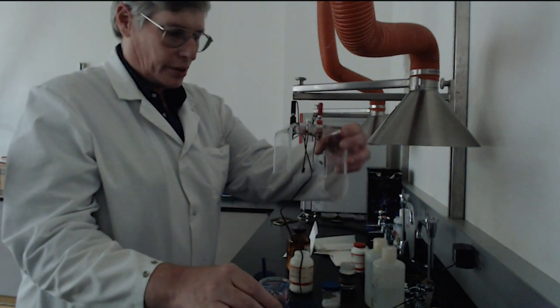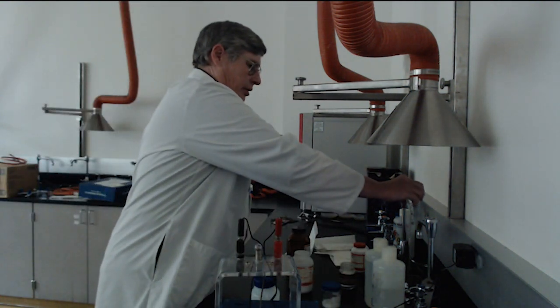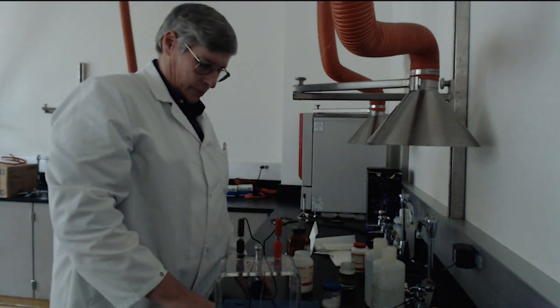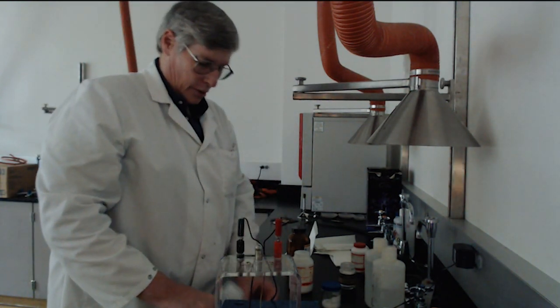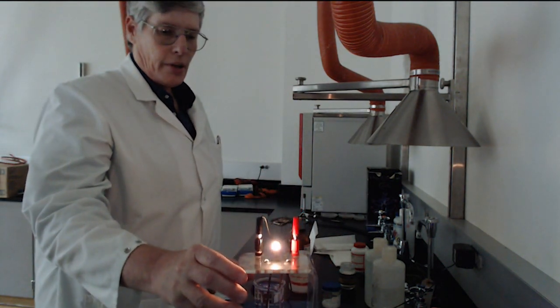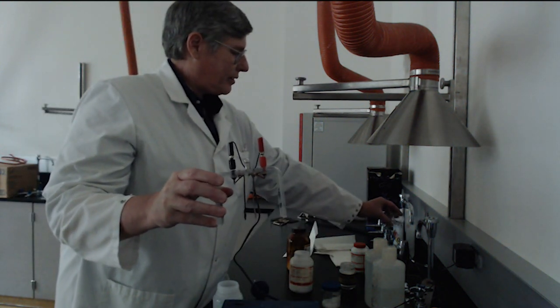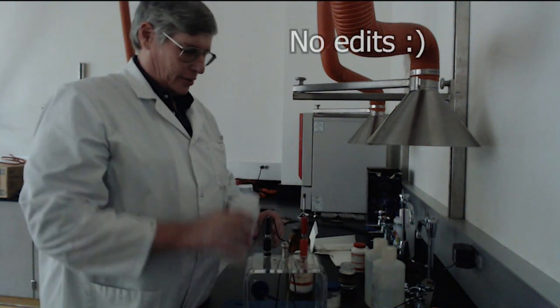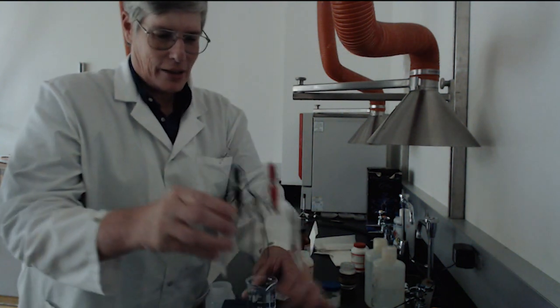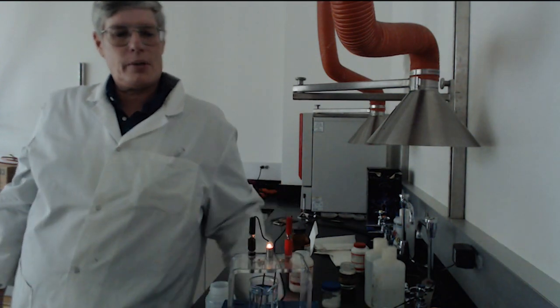I'm going to demonstrate that simply by pouring out half of this water, filling it up with more water. So even though it's exactly the same compound as it was before, it's still shining brightly. We're going to dump it in half again. Okay, so I reduced the number of ions and you see the conduction of the light bulb has dimmed.